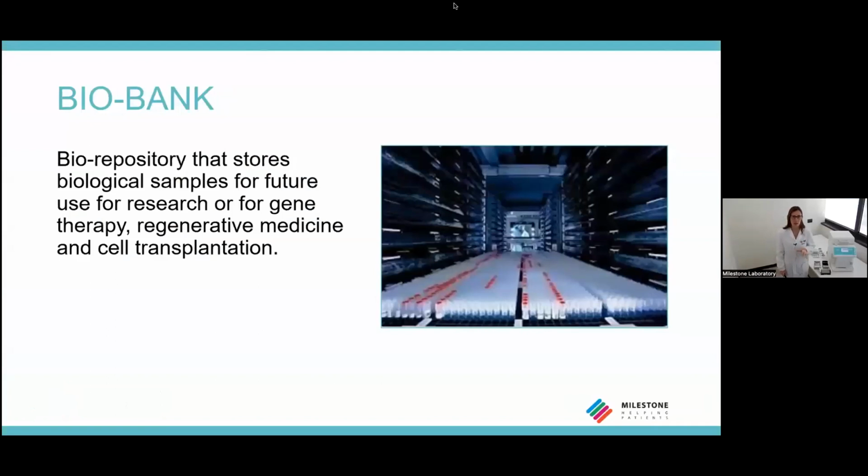Let's start from the basis. Biobank is a biorepository that stores biological samples for future use in research, gene therapy, transplantation, and regenerative medicine. So it is an important support for the healthcare, especially to find novel disease markers, but also new strategies for therapies.